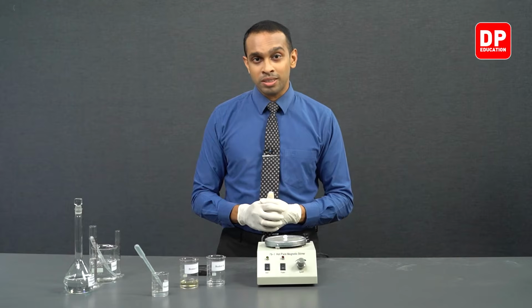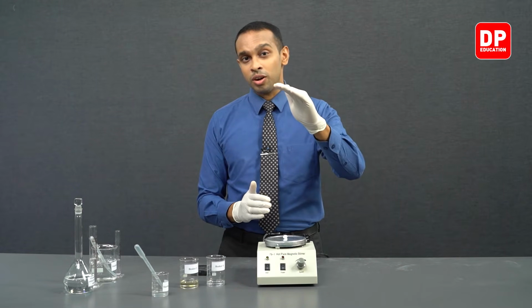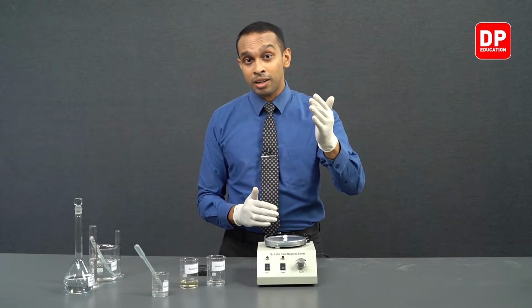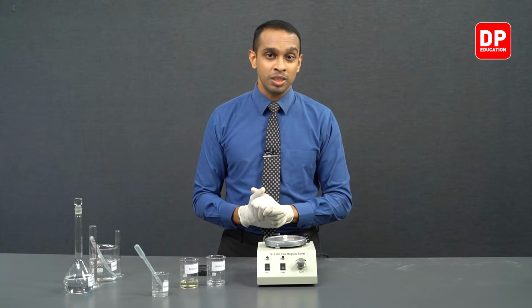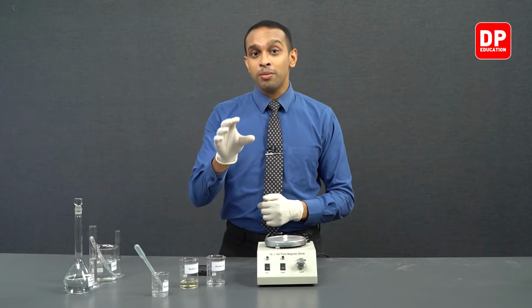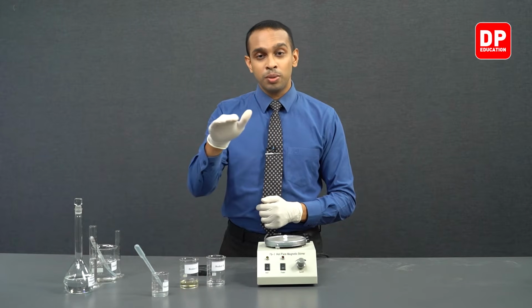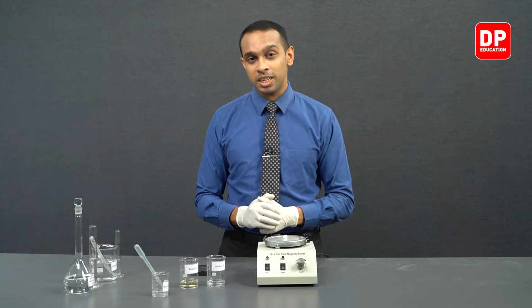different volumes of water. In this case, since we are going to be decreasing the concentration of Fe3+ by adding 5 milliliters less of the Fe3+ solution into the reaction mixture, we need to add 5 milliliters of water to make sure the final reaction mixture has 50 milliliters.